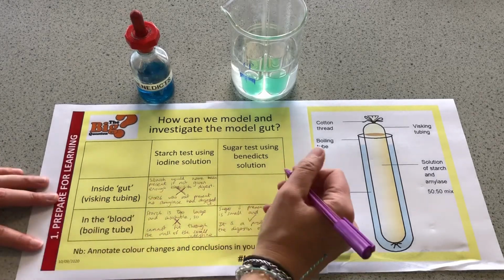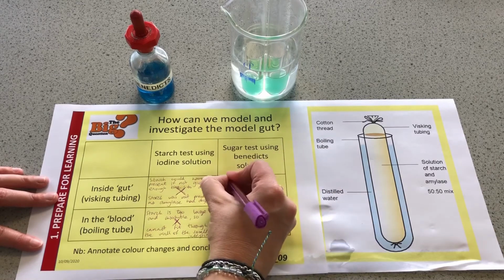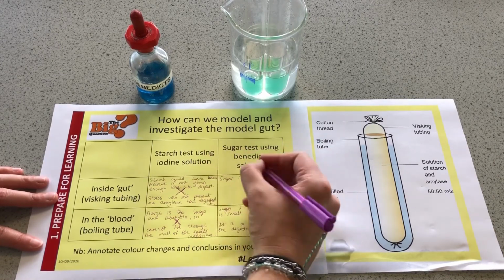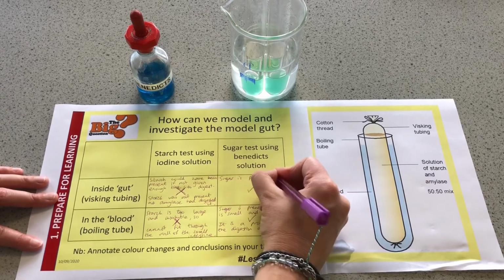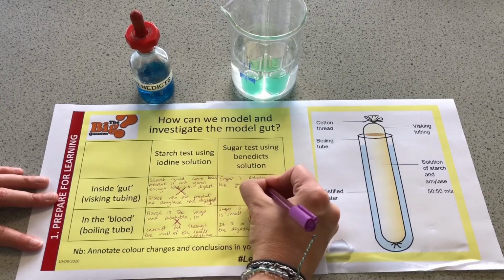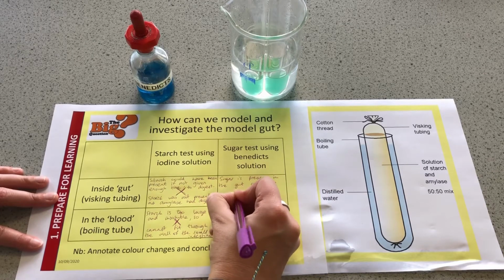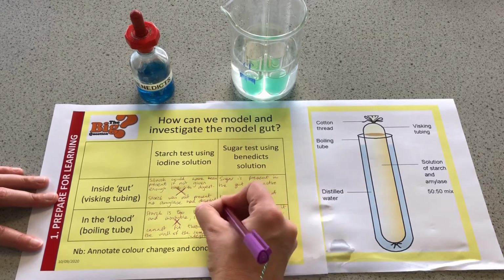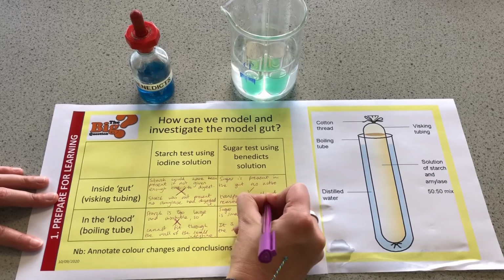So did we find sugar still in the gut? Sugar is present in the gut as active transport could not remove all of it.